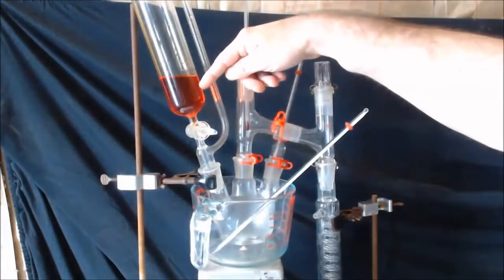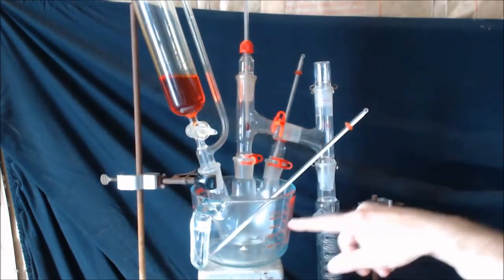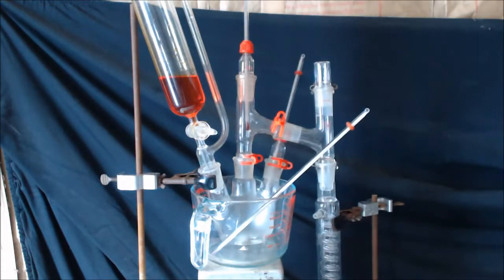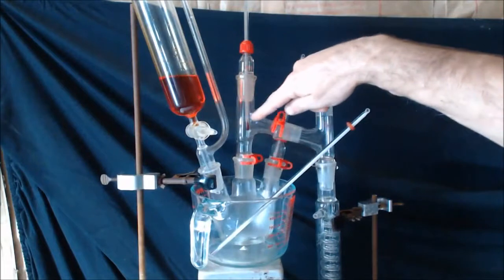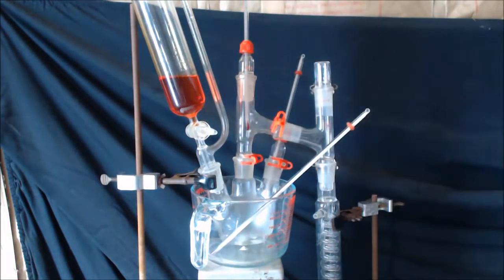We got our chromic acid. We're going to drip into our ethanol that's in here. Okay, and you can see it's reddish orange. When it comes down here, it'll turn green. That's why I want you to see this. I'm going to heat it up as it goes so it can distill. It'll come up here and come down here.